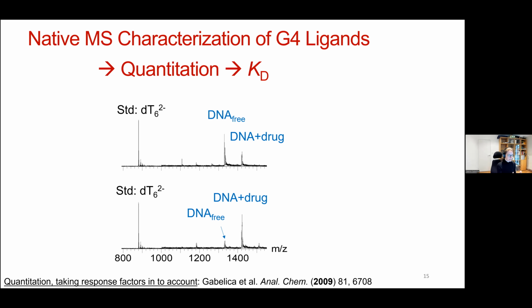Basically, it's an assumption that has always been questioned in mass spectrometry: can you ionize with the same efficiency different forms of a DNA, for example? And in this paper, we have shown how we can test this hypothesis just by using this internal standard I was referring to earlier.